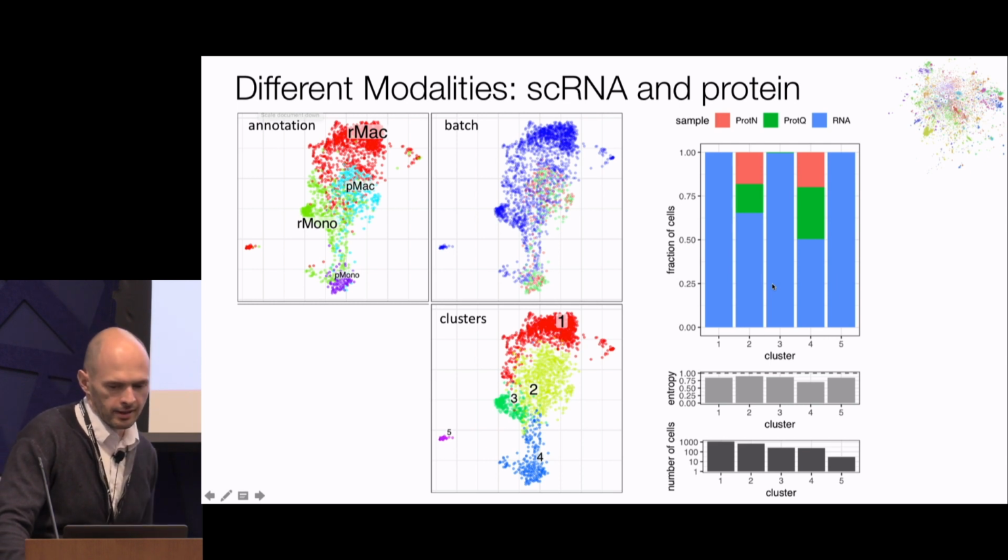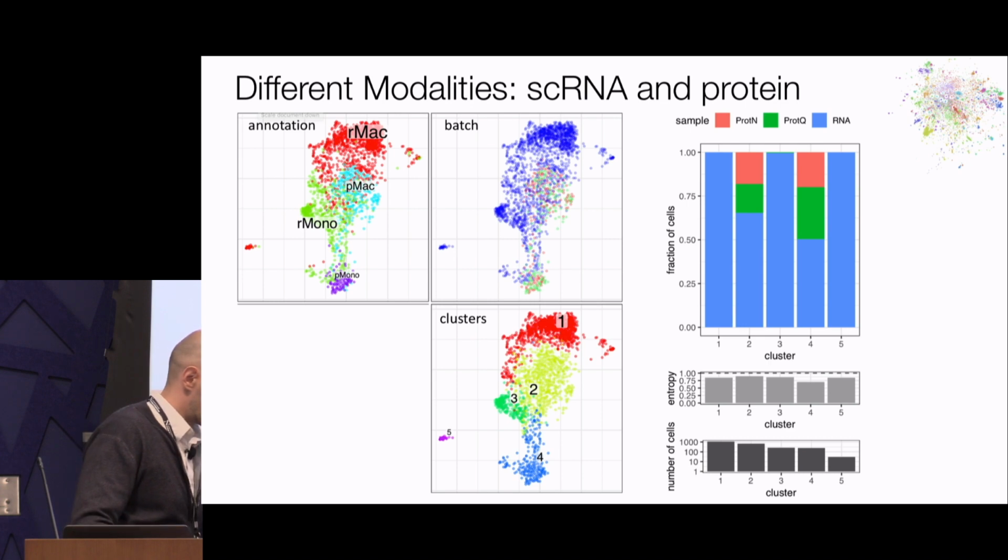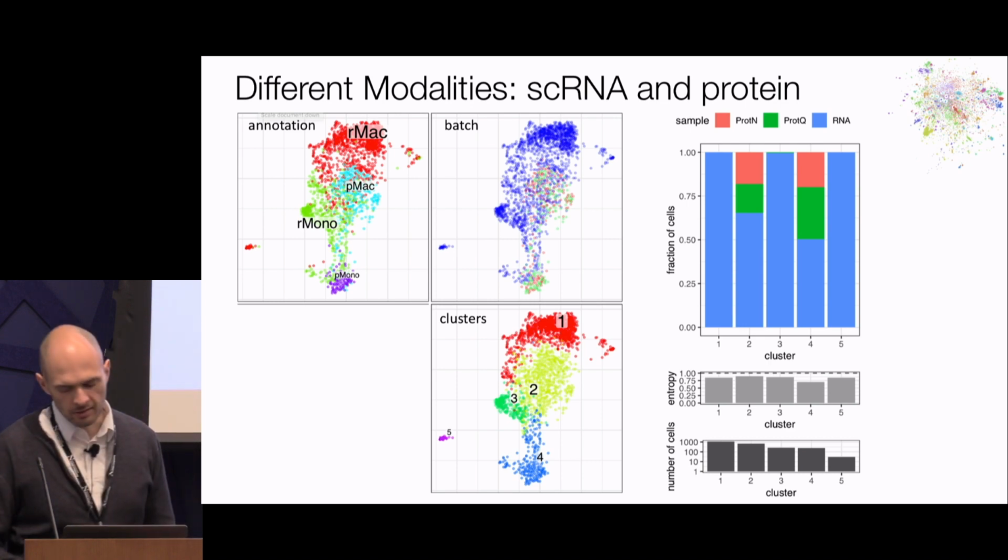Now, it integrated reasonably well, but of course, what I was interested in is the strength of the signal and the extent to which we can do these types of linking. So here, I'll just try to illustrate visually the consistency of differential genes, in this case differential expression.